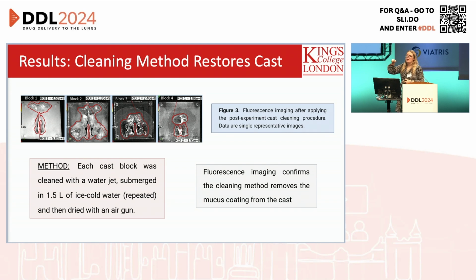And we then re-imaged the cast and compared this to background intensity. And we can conclude from this that the background intensity basically matched the intensity of the clean cast, and that there was no mucus left in the cast, basically. Yeah, as you can see here.